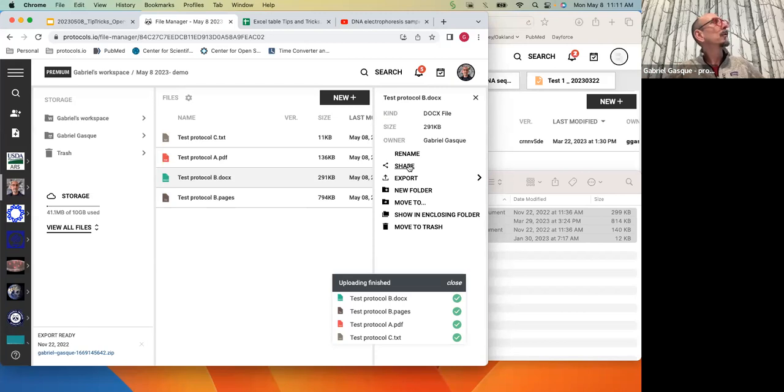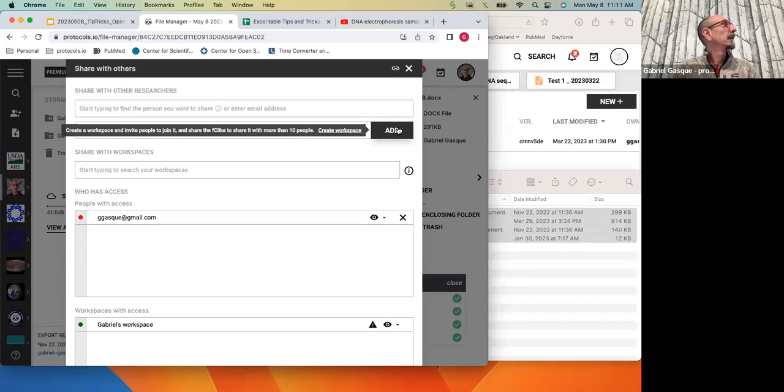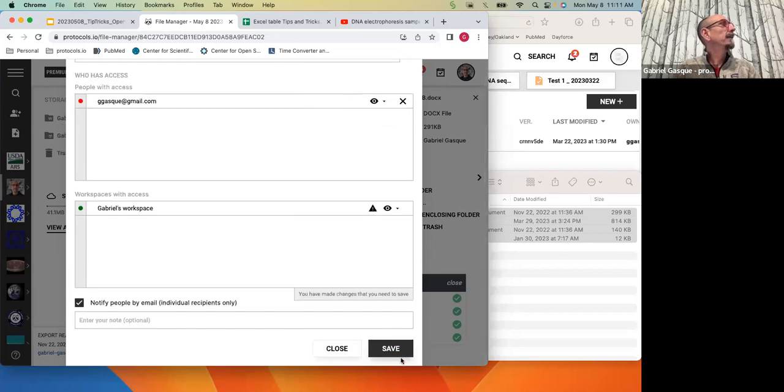So I will show you very quickly, even though we will touch on sharing again at the end of my presentation. I can share this with anybody just by typing their email address. And then I save it, and I shared that document with my collaborator.